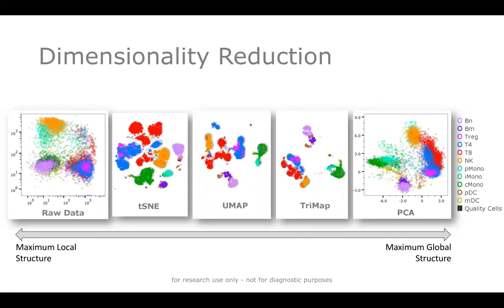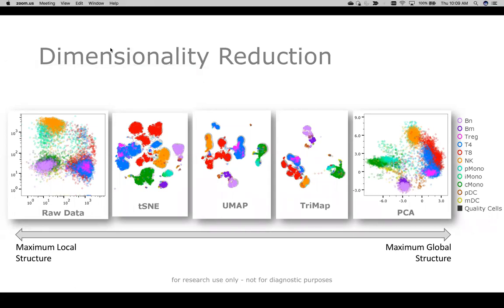Okay, so then we can also overlay subsets on top of that when we start to actually spot all those different populations I was mentioning. And you might notice that, let me grab my zoom controls here really quickly. I'd like to just be able to point to a couple of these different subsets. Not seeing it. Well, hopefully you guys can see my cursor all right.